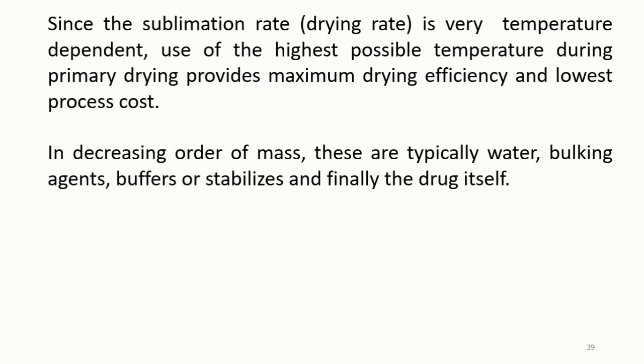In order to select the optimum drying temperature, it is necessary to understand the physical characteristics of components used in the formulation that is to be freeze dried. In decreasing order of mass, these are typically water, bulking agents, buffers or stabilizers, and finally the drug itself.